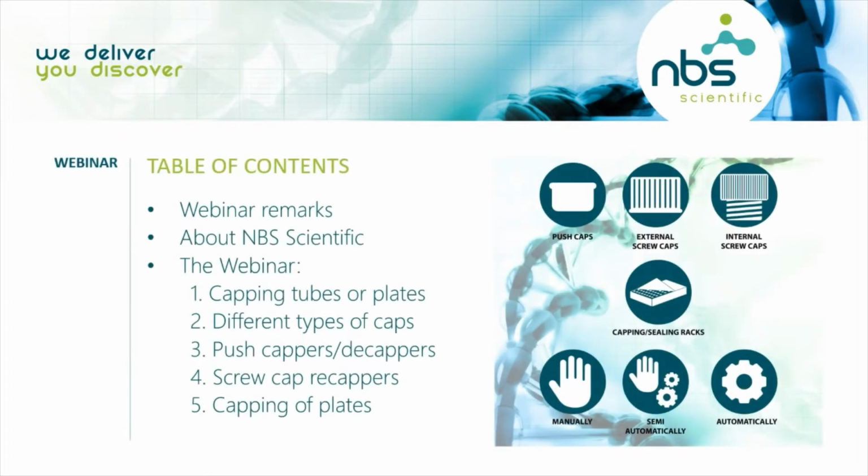Which topics will be tackled by this webinar? First of all, we have some webinar remarks. Next, I will present what NBS Scientific stands for. Then we will talk about the next topics: capping tubes or plates, different types of caps, push cappers, decappers, screw cap recappers, and the final topic we want to talk about is the capping of the plates.